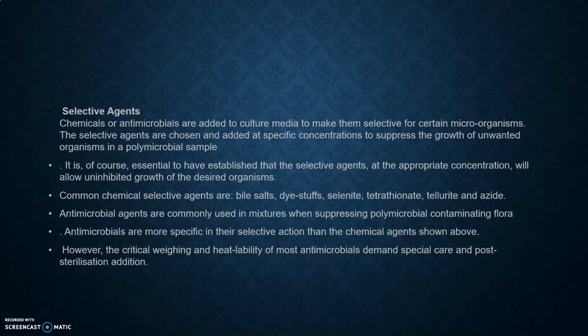So, this type of agents are added after the sterilization. Otherwise, it may cause destruction, because antimicrobial agents also act on certain types of microorganisms. So, it may destroy them, and they are heat labile also. So, after sterilization, we are adding these antimicrobial agents to the culture media.